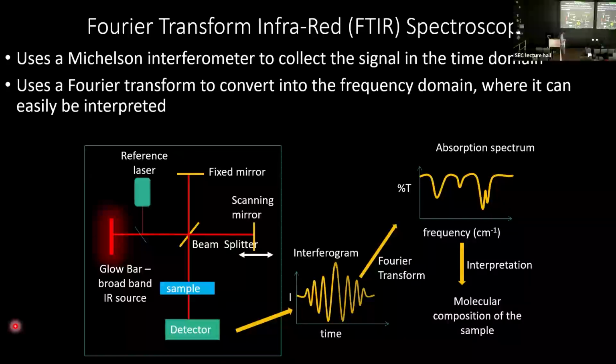So we get this interferogram on our detector. At the zero burst, everything's in phase and we get a strong constructive interference. And then as the scanning mirror moves, things will get out of phase and in phase, out of phase. And it dwindles off going both directions because it's broadband and different wavelengths will come in and out of phase at different points.